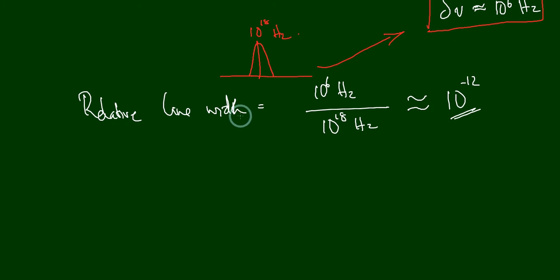So what is the consequence of this? The sample iron nucleus can absorb any range of frequency which will fall inside this band. It is not necessary that the sample nucleus should receive 3.5 × 10^18 hertz exactly.